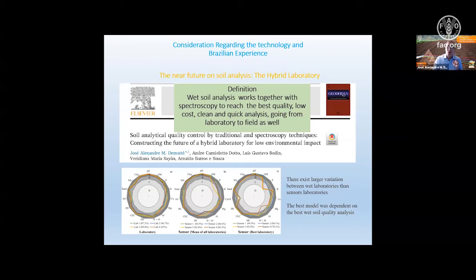Well, let's continue on the hybrid soil analysis. I'm going to show a short film about this, and then I will continue with how I see it. This is in practice how you can construct a hybrid laboratory, and this is only one idea. Okay.